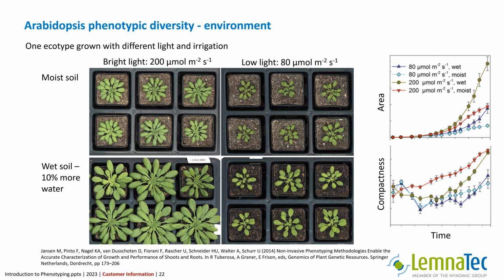This example shows that phenotypic data in combination with background information about the plant growth conditions can lead to explanations of plant growth behavior. It shows also that dynamic data in time-resolved repeated data acquisitions delivers additional data that are not available in one-point acquisition at the end of the experiment.